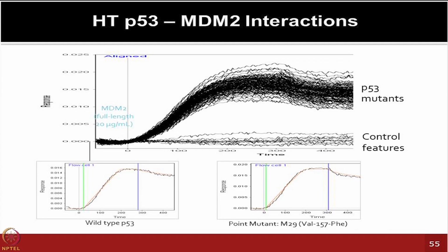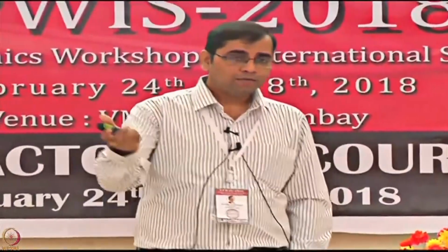Especially, we were also finding that there was probably some sort of bulk effect we could observe even in the control spot. There is some sort of binding which one could observe. So for the next steps of this technology development, even for NAPA chemistry, the HaloTag chemistry which you are seeing now is showing a much more robust signal. So could we now try out the same thing on the SPRi platform using the revised NAPA chemistry?